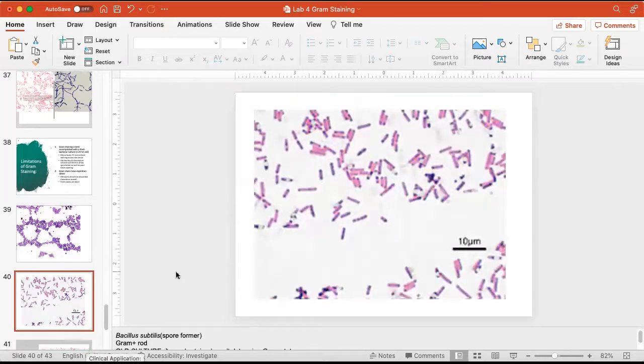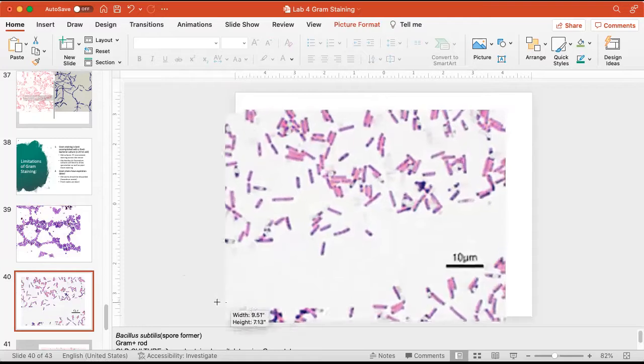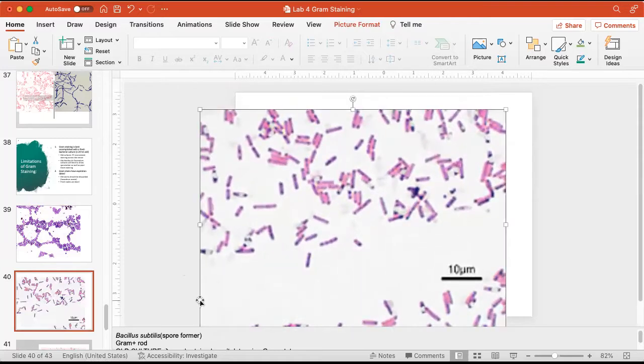Here's another good one. Take a look at this. Again, pure culture. These cells were grown in a culture container in the incubator. See how inconsistently they have picked up stain. This smear was gram stained. And boy, oh boy, I don't know what I've got.